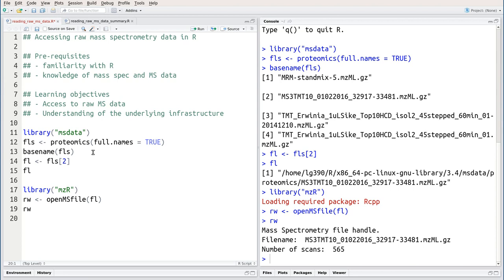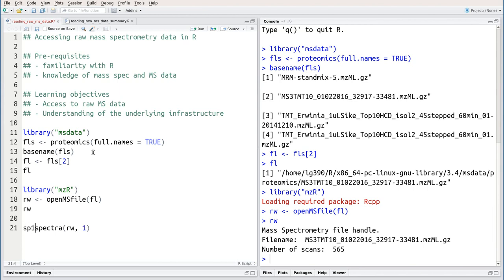Now we have this file handle. If we want to access data, in particular the raw data and the spectra, we can use the spectra accessor by providing as input the file handle and then as second input the index of a spectrum of interest. For example, spectra rw1 will generate this variable sp1.